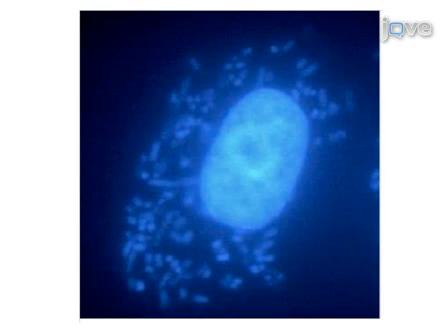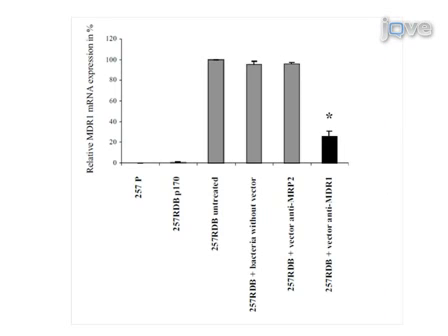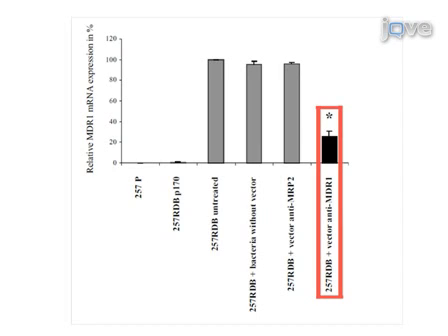This representative image was taken 3 hours after incubating human gastric carcinoma cells with bacteria expressing therapeutic shRNA. Bacteria can be detected around the nucleus of the treated cell. In this experiment, downregulation of the expression of the multi-drug resistance gene MDR1 was examined by real-time PCR. Downregulation of MDR1 mRNA of about 70% can be seen after treatment with the therapeutic bacteria.